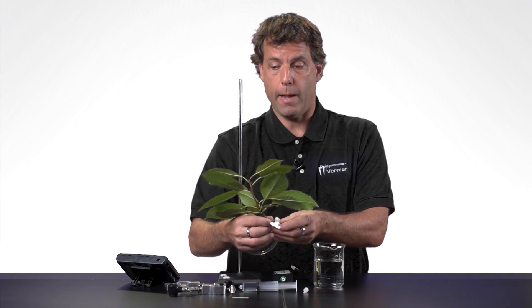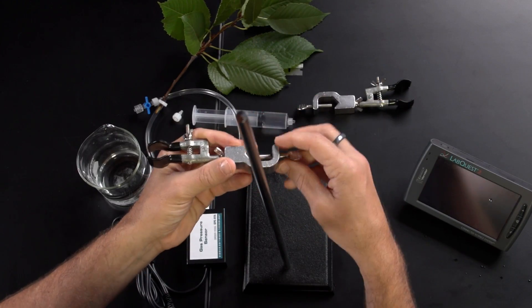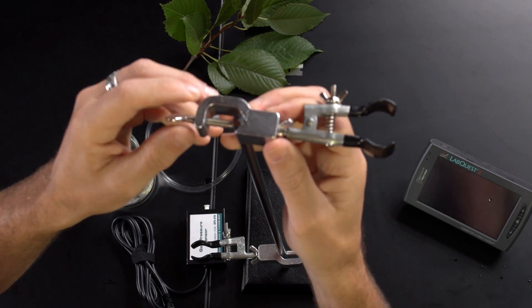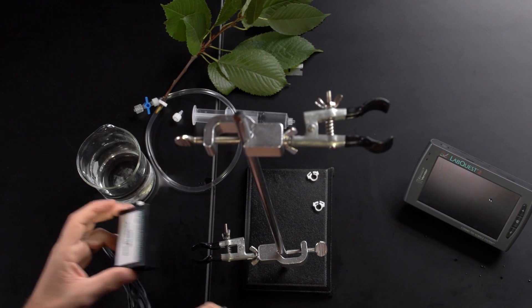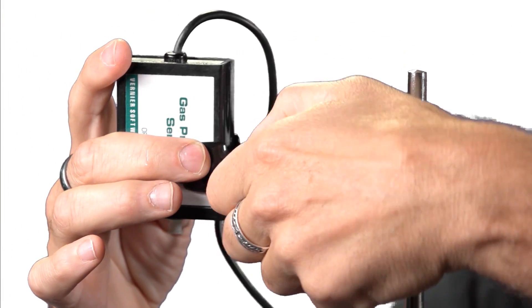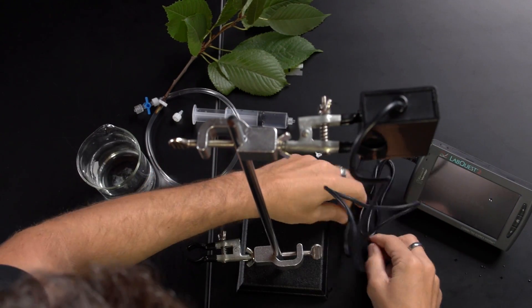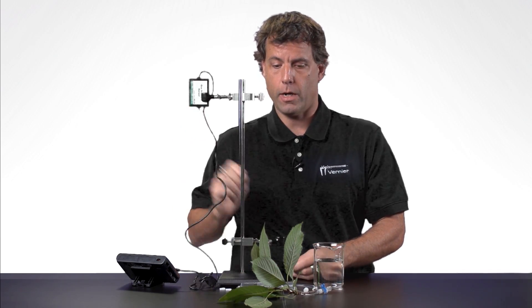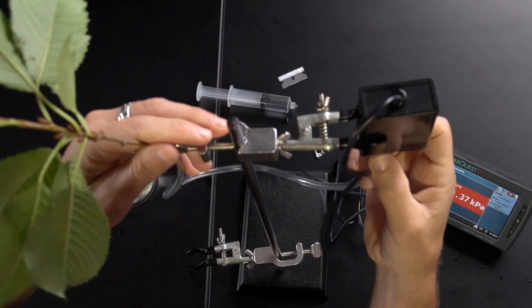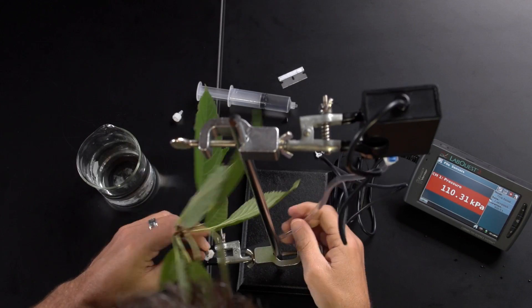Now I'm going to take the stem and attach it to the rest of the apparatus. I'll take one clamp and put it down low, and another clamp up high. Then I'll take the gas pressure sensor and attach it to the clamp placed high, then attach it to the LabQuest 2. Next I'll attach the tubing to the gas pressure sensor and place the plant on the lower clamp, connecting it all together.